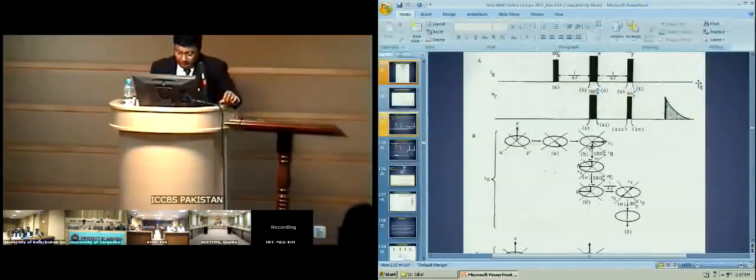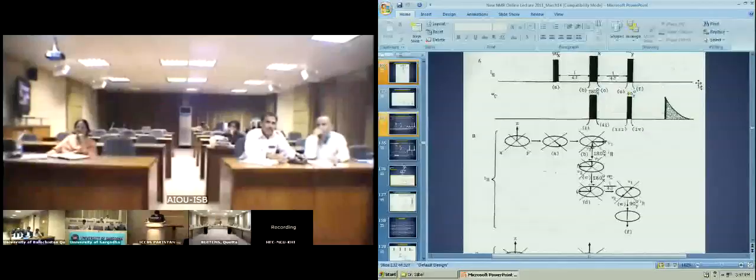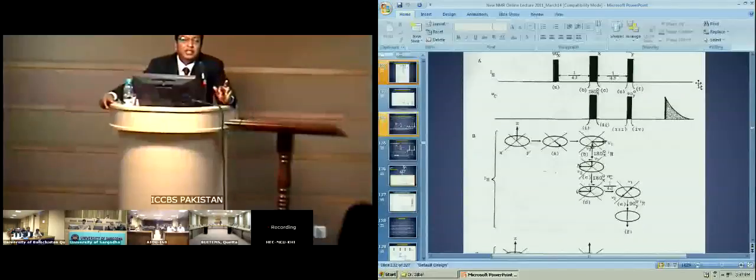Sir, if it adds to the NMR signal, the C13 signal, this is called polarization transfer. In the signal of proton? Yes. You see, instead of plus 4, you see a minus 4. The 4 into 4 doublet is now appearing as plus 4 and minus 4.